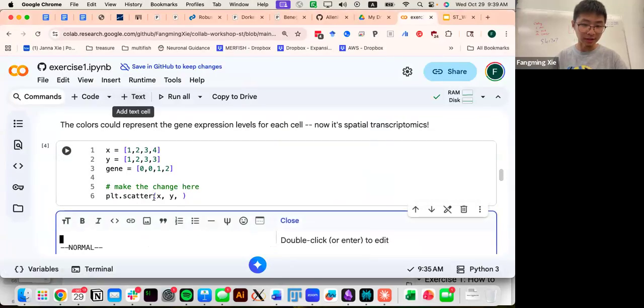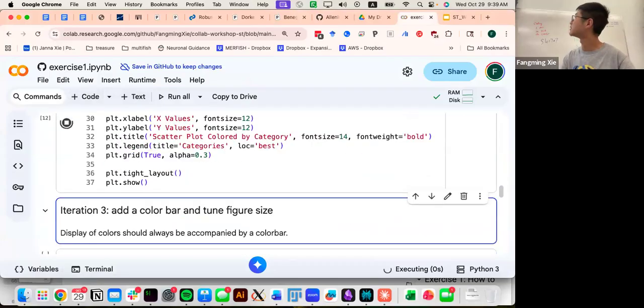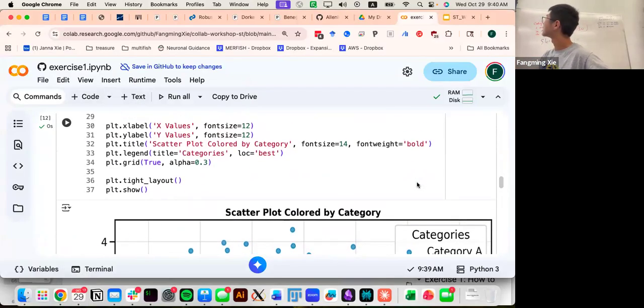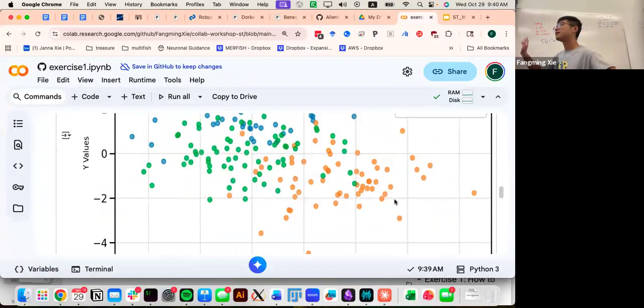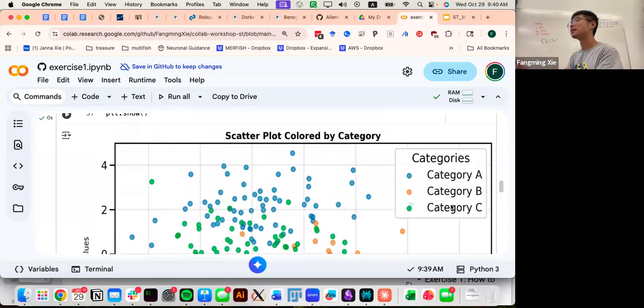Without looking into what it says, let's first try to check if the AI is correct or not. Oh, now they made a scatter plot for you, right? I just copied all of their code, and it looks like they made a scatter plot colored by 3 different colors. I didn't read through their code; it's quite complicated, but that made some progress. So if you were able to do that, you can then go back to the code and see which line actually did it. But in this case, though, I knew it wasn't what we really wanted.